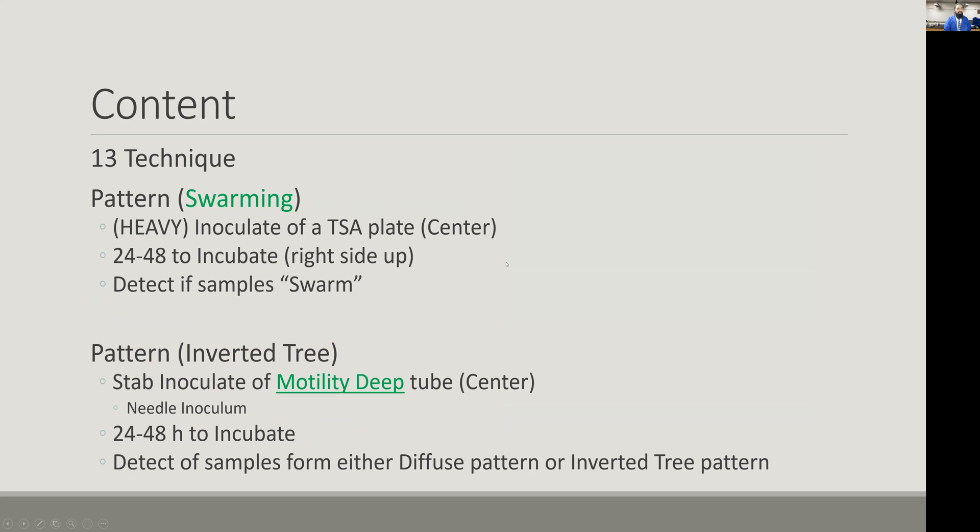For lab 13, we practice two separate techniques, detecting two different types of materials to observe motility. This one is more passive—we inoculate the system and give it a couple of days before observing. The first technique is called swarming. We use a standard TSA plate with a heavy inoculum. Rather than doing a loop with a tiny pickup, we use a cotton swab, dip it heavily into the organism, and place a glop right in the center of the plate.